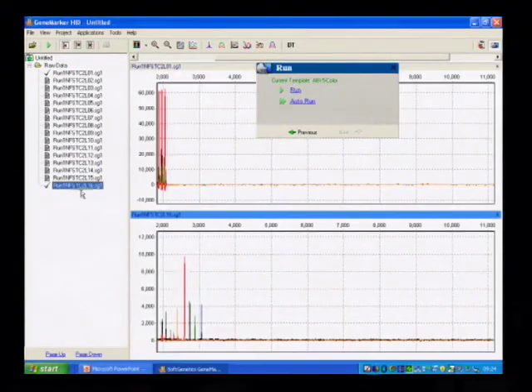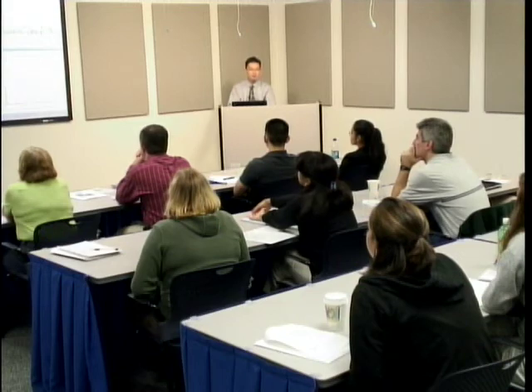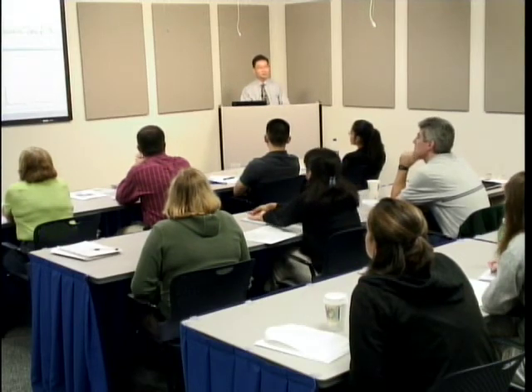Okay, so the DS33 is loaded in lane 16. What we do in our lab is, when we call up the software, the first thing we go to is the DS33 size standard, and we check on it to see if blue is truly blue. In this case it is. No residuals from the other colors, green, yellow, red, and orange. This gives us confidence that the software trace processing has functioned, and if there are any issues related to software, we know where they lie. Either it's on our end, the trace processing before we put it into the software, or it's somewhere else.